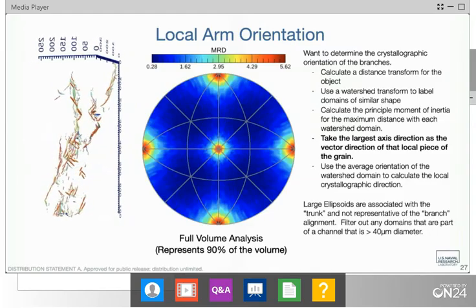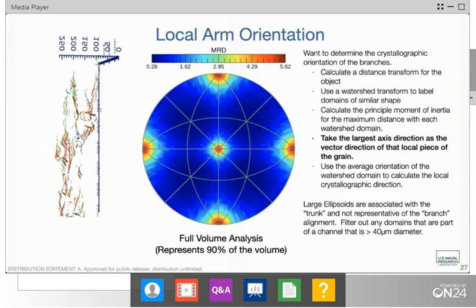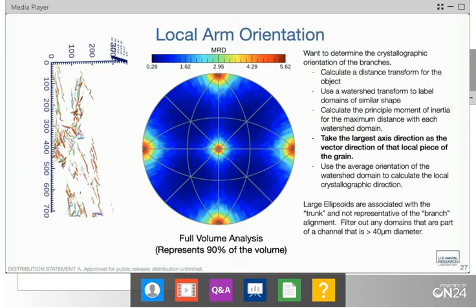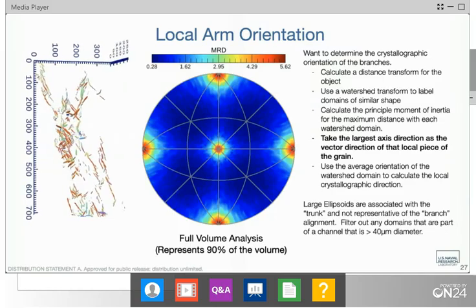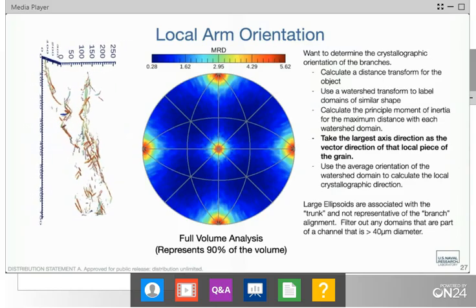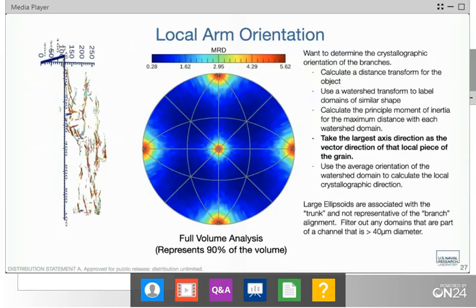The question is how can we index or measure accurately acicular ferrite, carbide-free bainite, and lath martensite, as these all belong to the crystal structure of BCC and BCT?